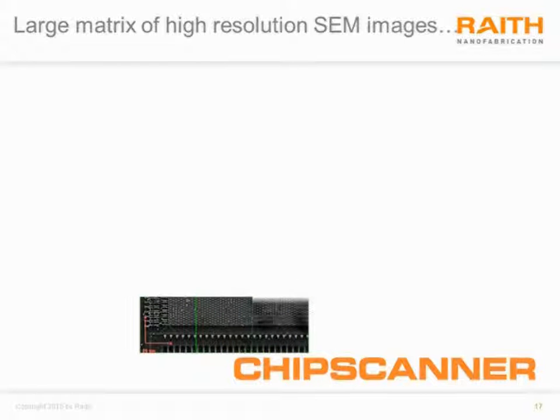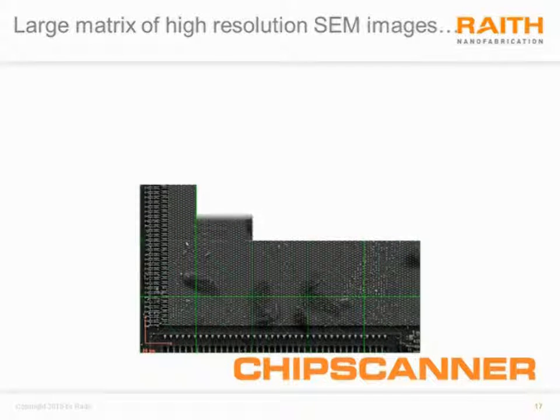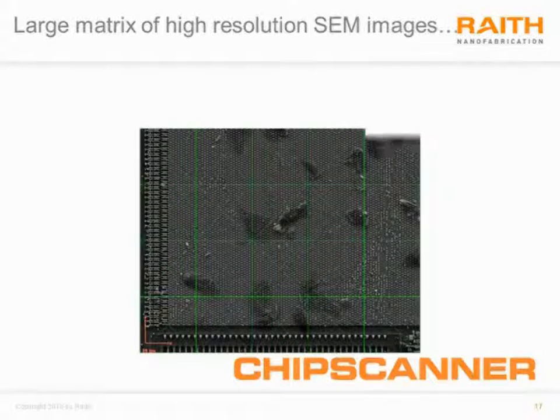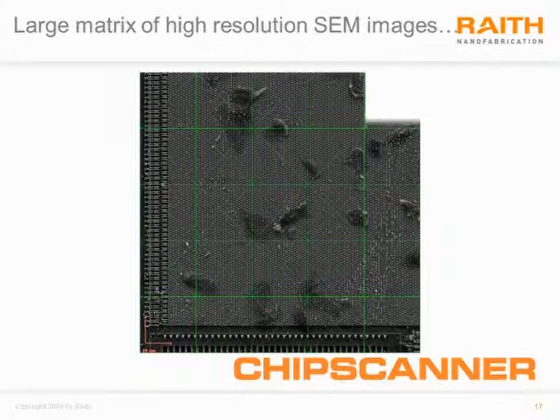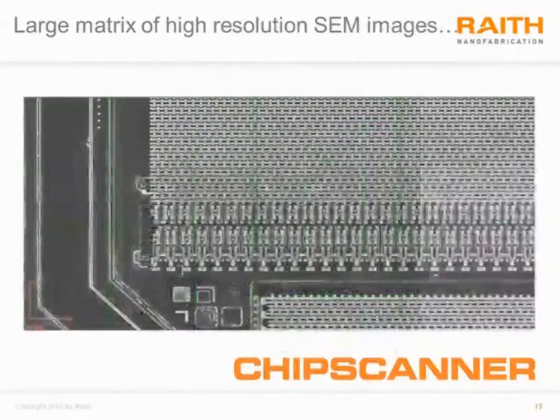Next, the laser interferometer moves the sample and an image is captured. And then it moves the sample and an image is captured, and this is just repeated over long time periods to cover large areas of this particular layer. So now we have about 250 by 250 microns of image captured.